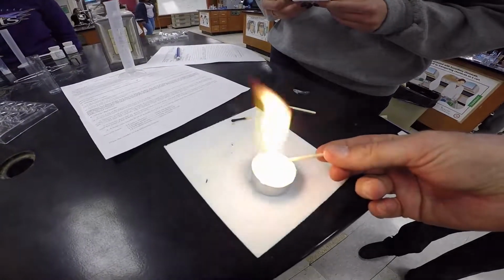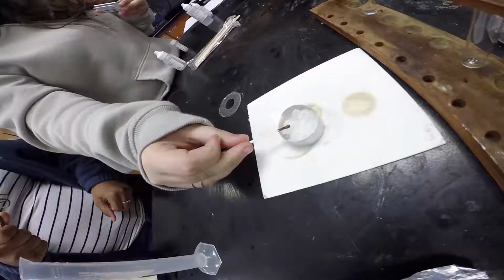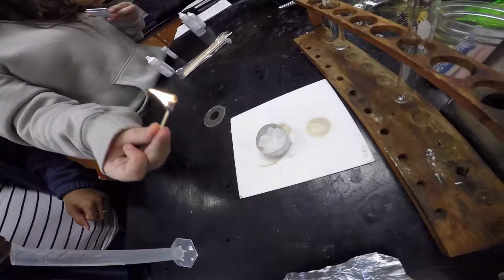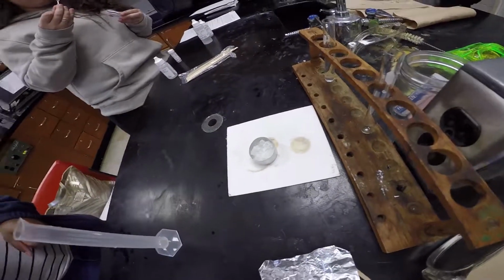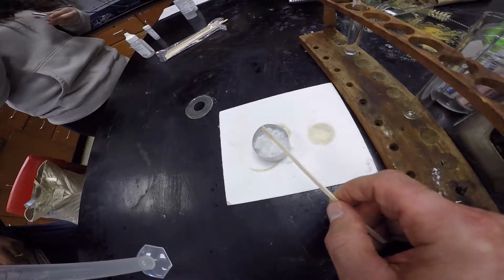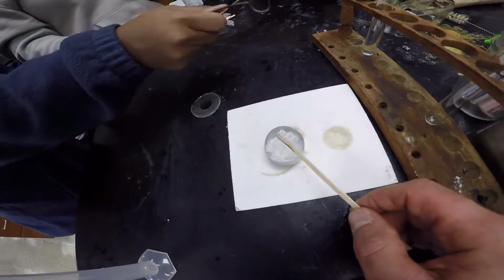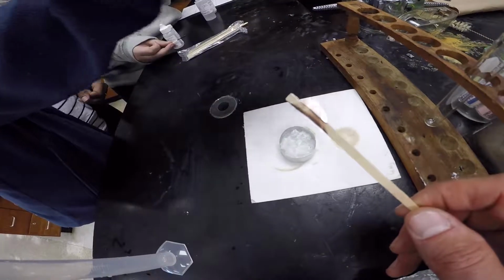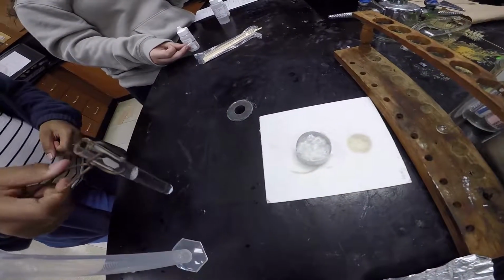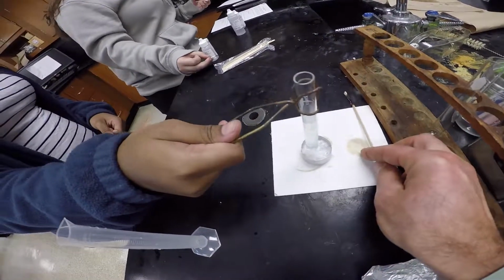It's hard to see that it's actually lit, but it's on fire there. It's pretty cool. Oh, so just leave it like that? Yeah, it's hard to tell that it's lit, but if you take a wood splint, it should begin to ignite. So hold it over there. See, it's catching on fire. It's pretty cool. It doesn't look like it's on fire. That's what makes them kind of dangerous.